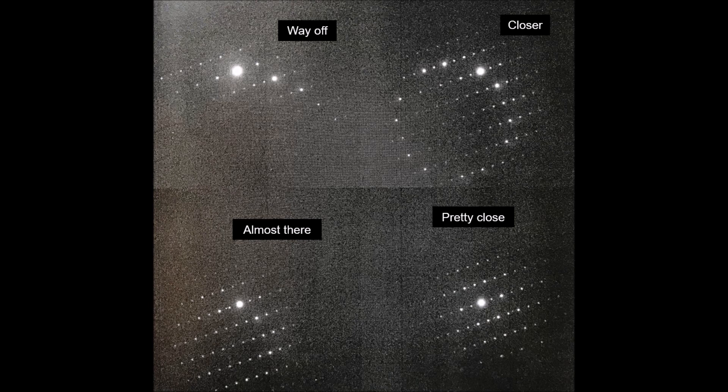Now if I get a little bit closer to the zone axis, like in the upper right, you can see now I'm getting closer to satisfying that intensity criterion. But I still have an open circle, which again is what we call a Lowey circle.